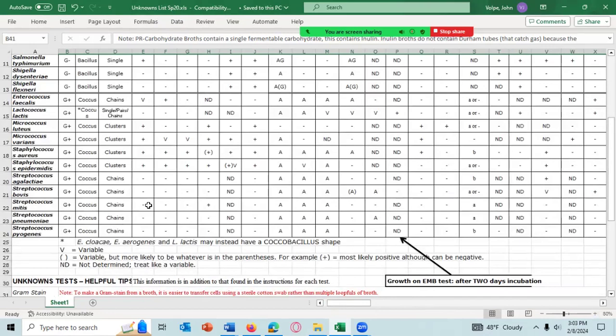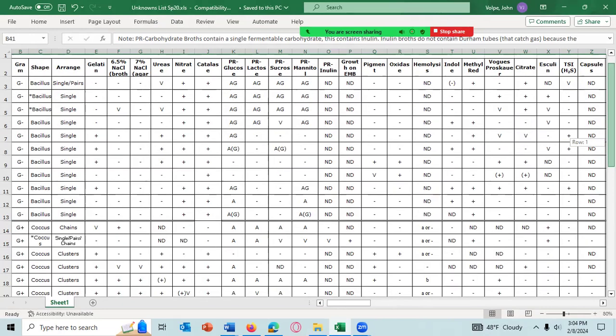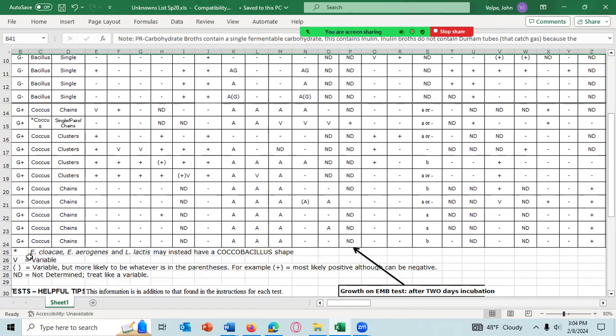When you're coming on here, I think you know what a plus means. That means for this test, the results are positive. And if it's negative, the results are negative. The V, however, means that the results are variable. Did I discuss that? Anyone? I don't think you discussed it directly, but I kind of gathered it from what you talked about. Okay, thank you. I thought I did not, so that's why I wanted to make sure. It does say down here what the symbols mean, and a V means variable.